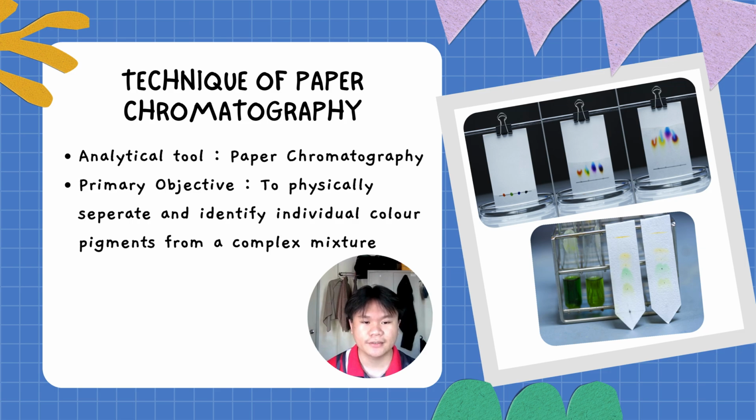Chromatography is a physical method of separation where a complex mixture is divided into its individual chemical components. By applying this technique to a sample extracted from a candy shell or a sports drink, we can physically pull apart the blended colors to see exactly which specific dye pigments the manufacturer used.